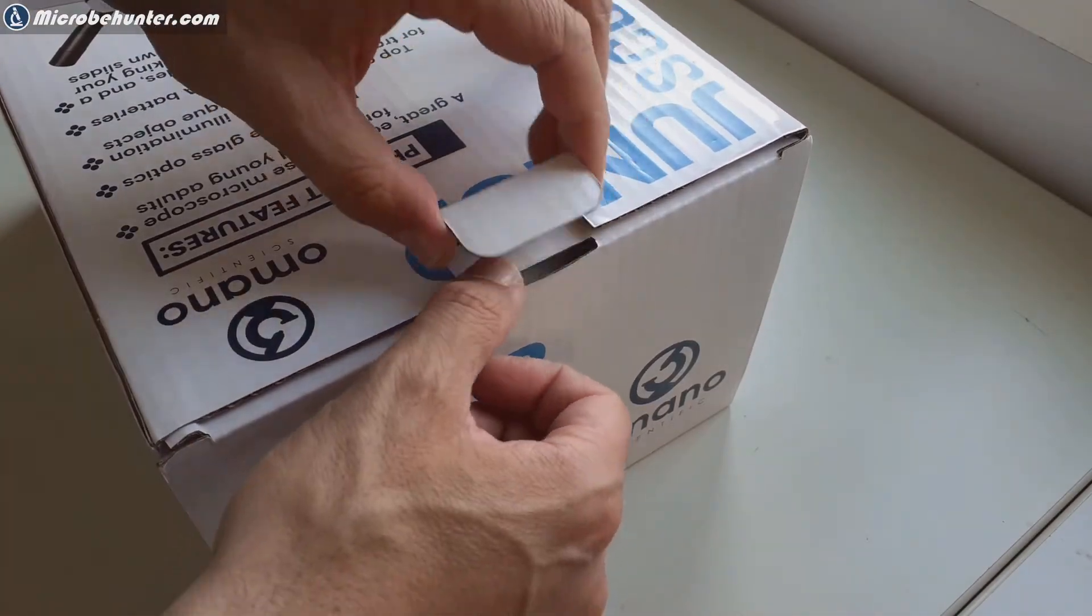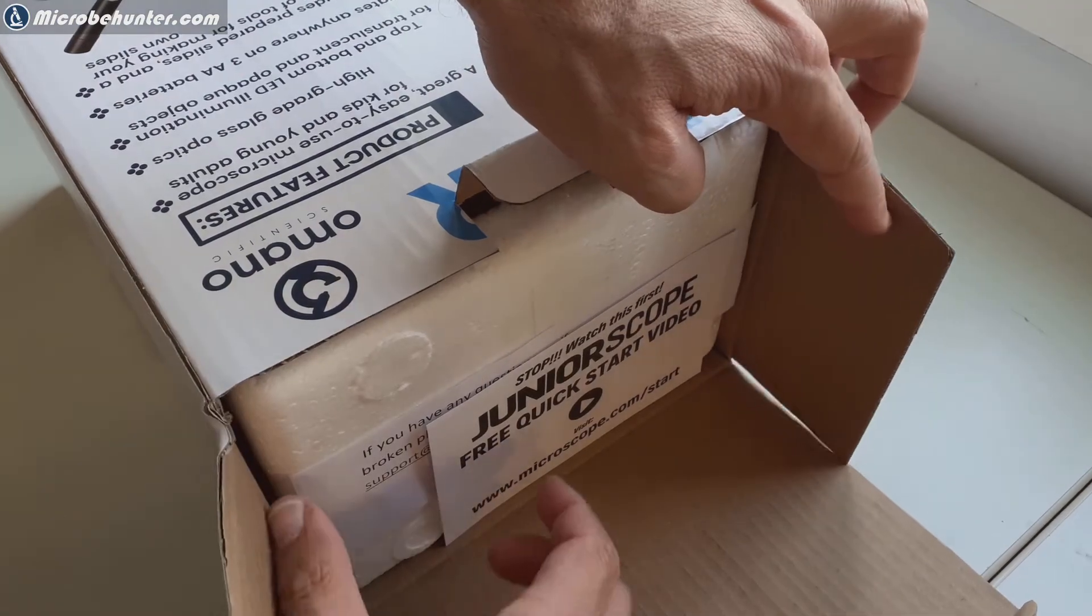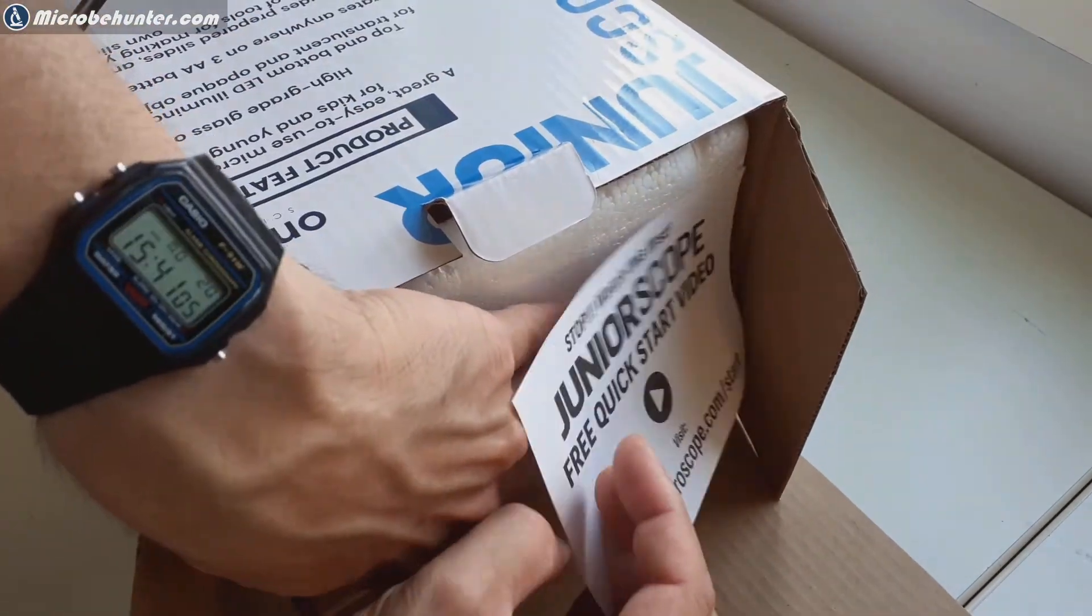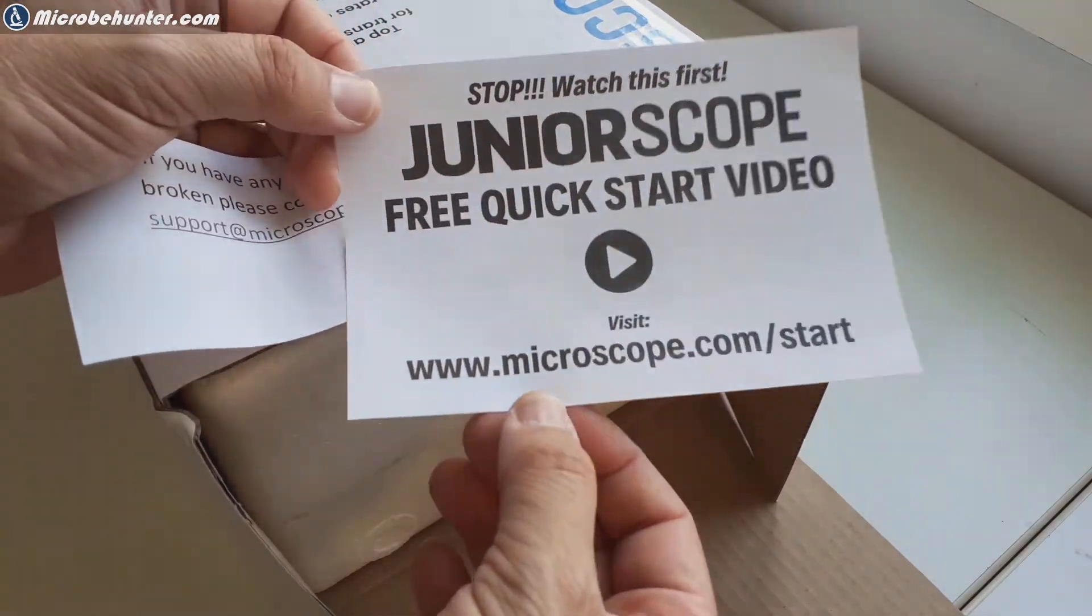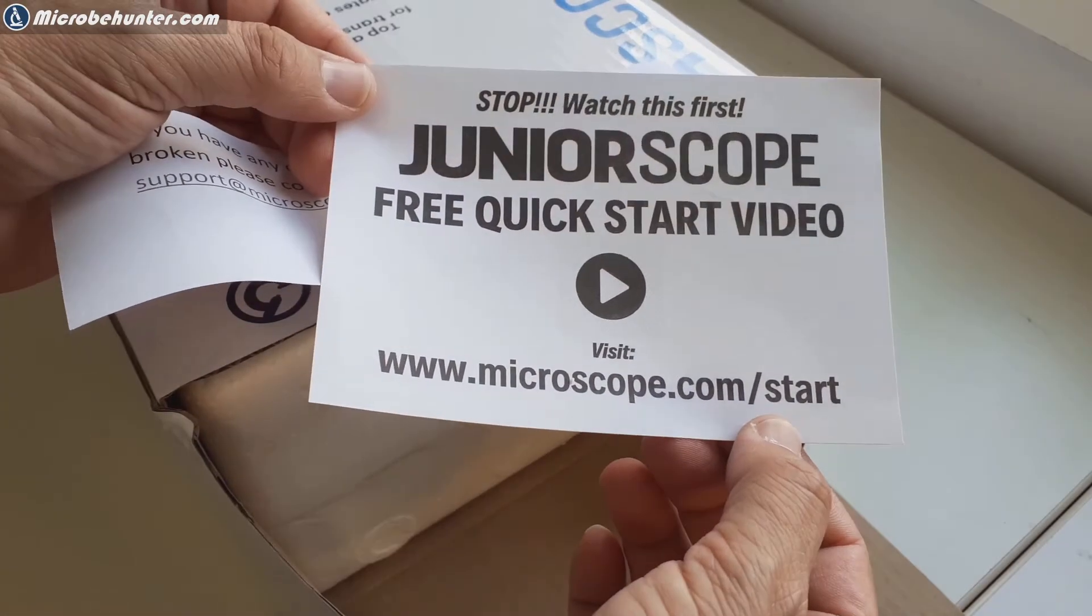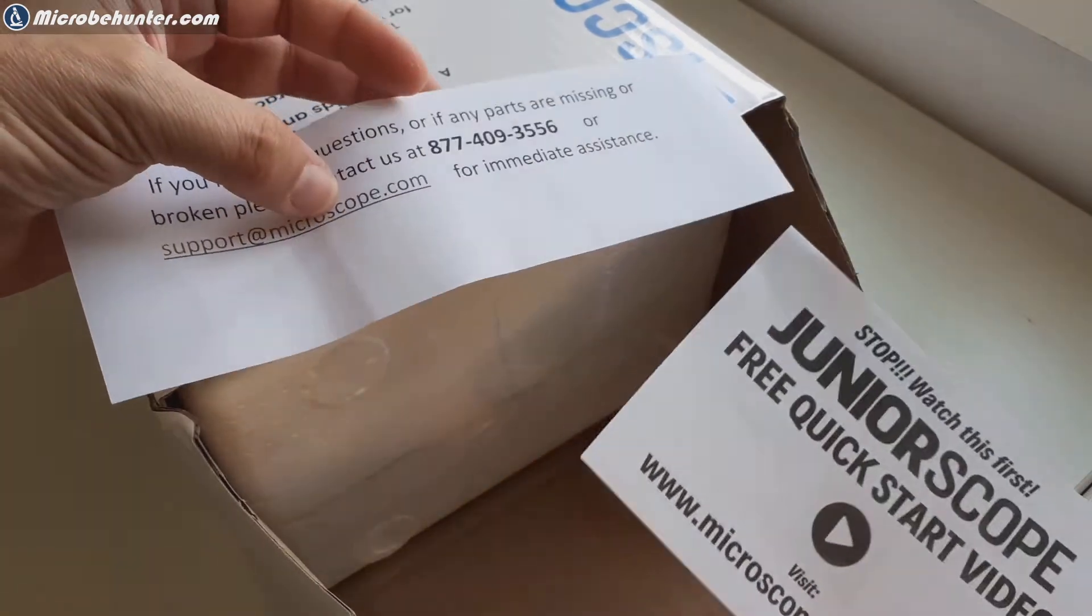Here I'm now of course unpacking it and I was immediately positively surprised because there were two sheets of paper included with links to an introductory video. So children or also adults who do not know how to use a microscope will receive the first important information there.